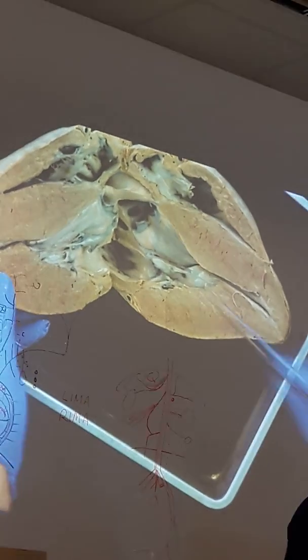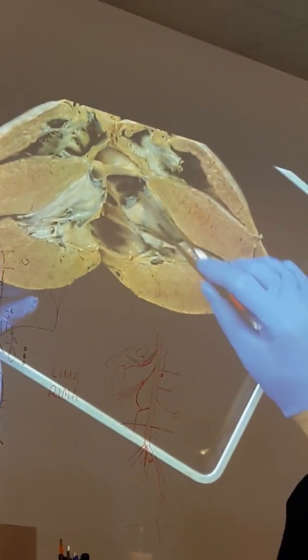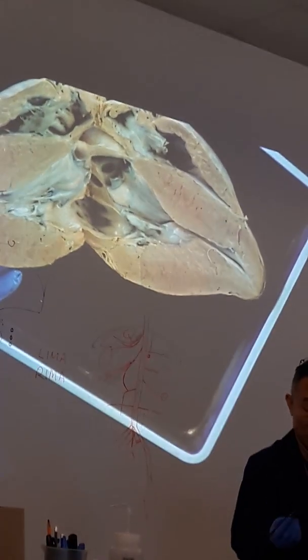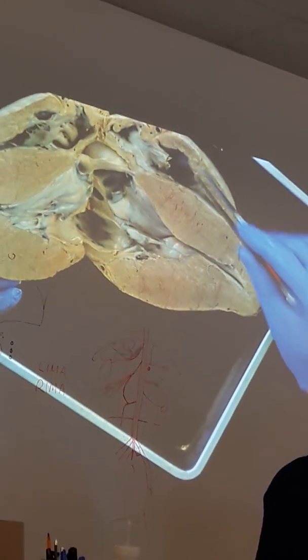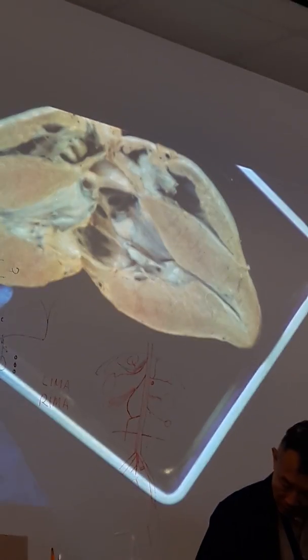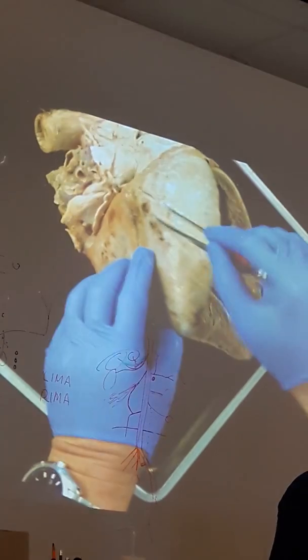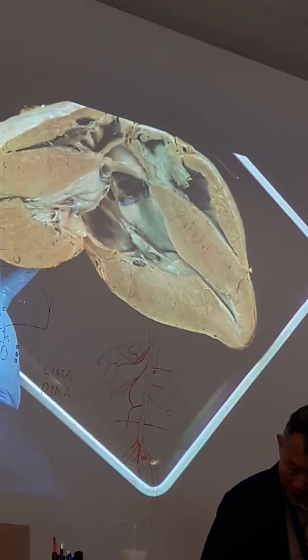Endocardium is shining there, covers the chamber and the atrium. Okay, they are also simple squamous epithelium. Okay, we've got endocardium. Myocardium, these are all myocardium, the cardiac muscles. Okay. Epicardium, it's outside. We put it here, just try to tell you, endocardium, epicardium is different, but the same type of tissues.